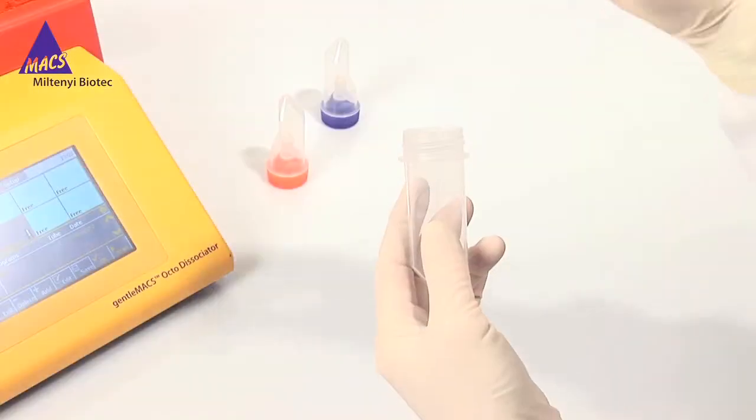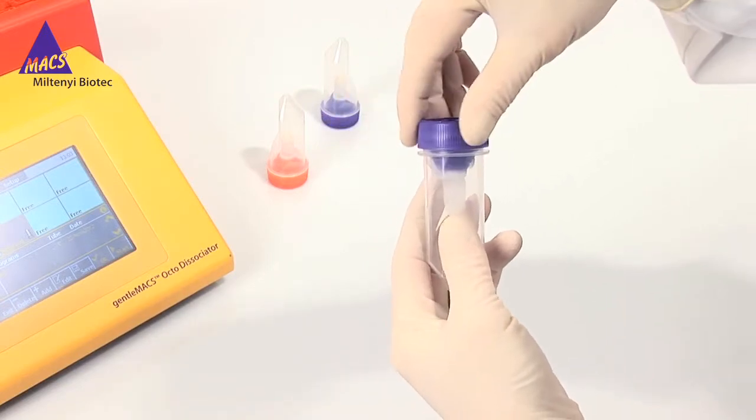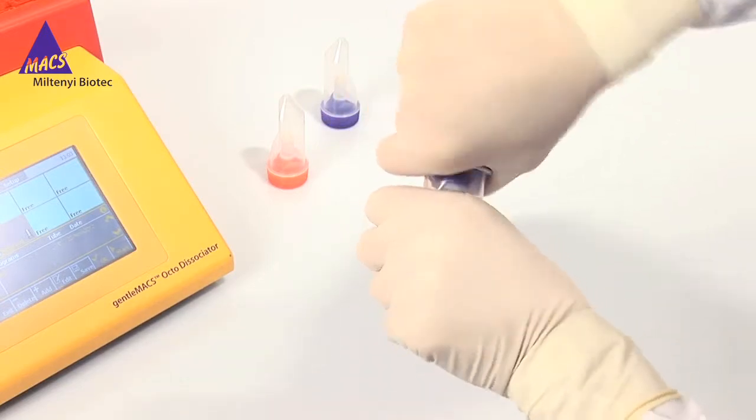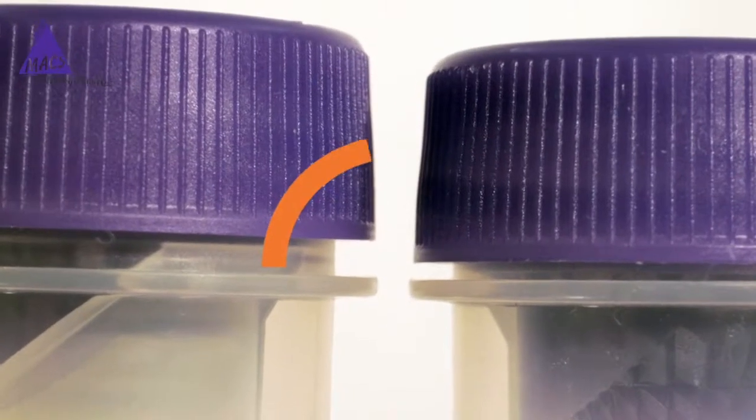Let me show you how to install a GentleMAX tube into the instrument. No matter whether you use a C tube or an M tube, it is important to close it completely. Once you feel the first resistance, give it another firm twist until the gap is closed.